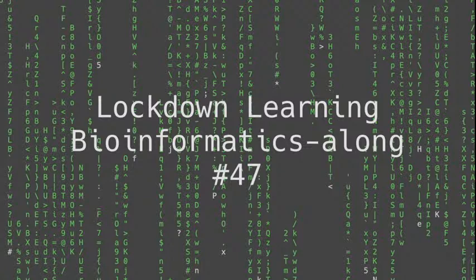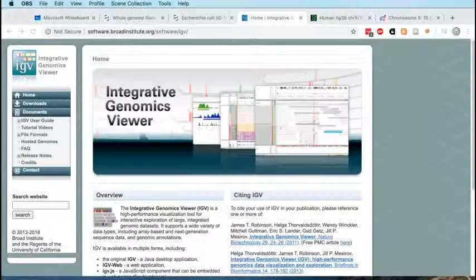And the standalone genome browser that I typically use and recommend is the Broad Institute's Integrative Genomics Viewer, or IGV. IGV is a piece of software that's been around for quite some time.